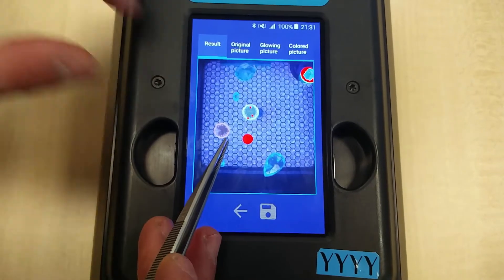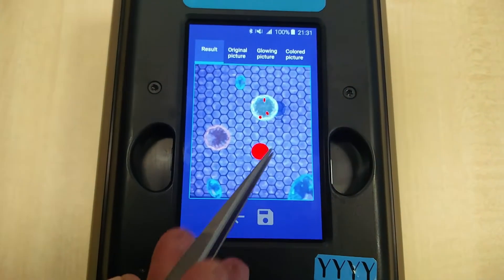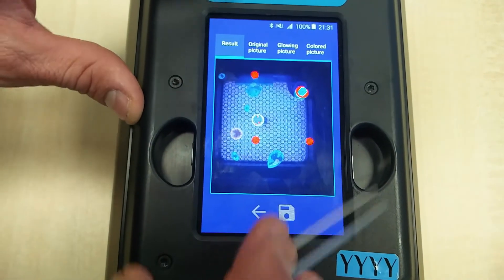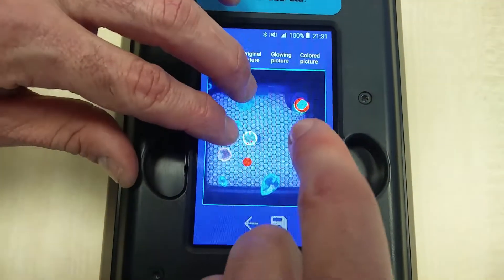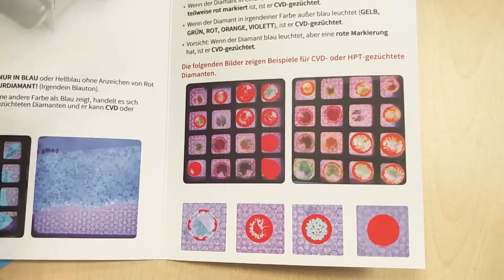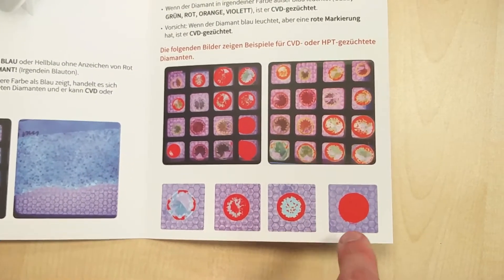The yellow one and the brownish ones are CVD lab-grown diamonds. The red ones are HPHT. For example, if a stone shows just a little bit of red, or is half red, it also means HPHT.